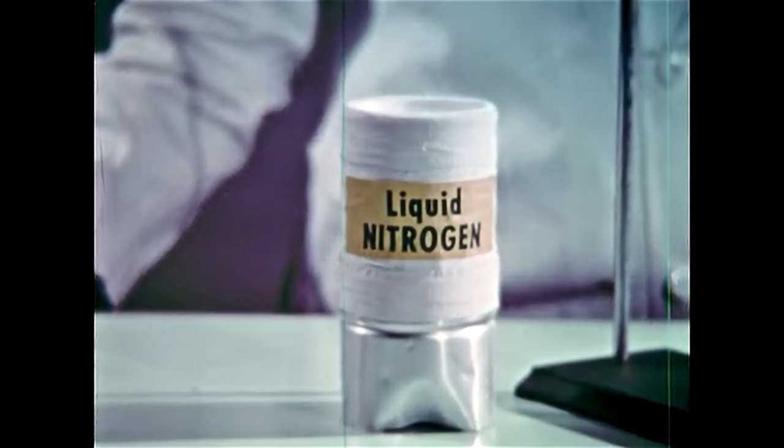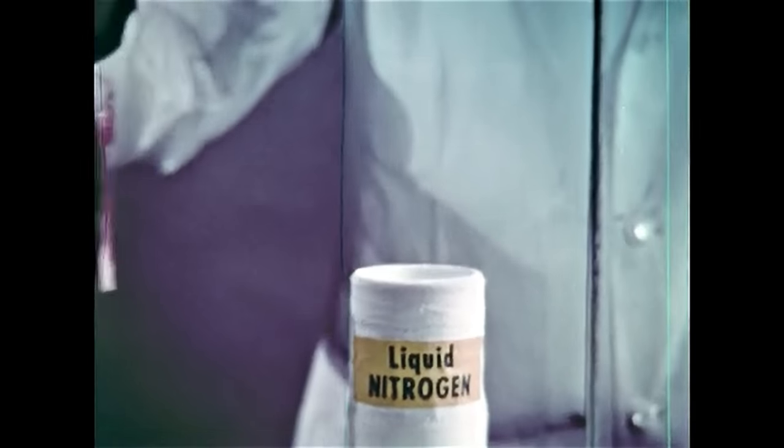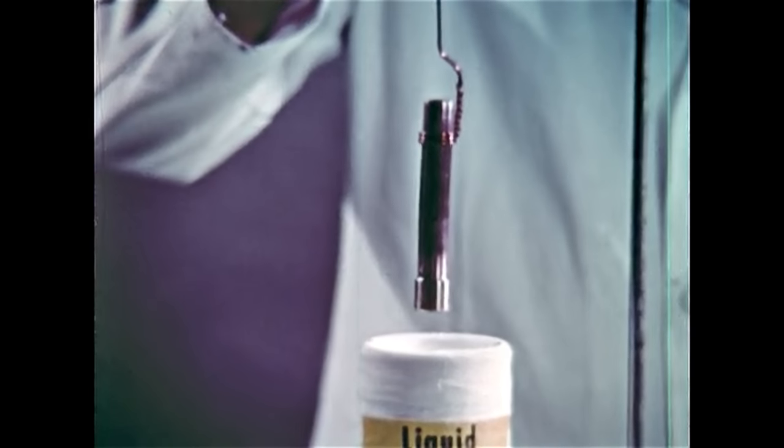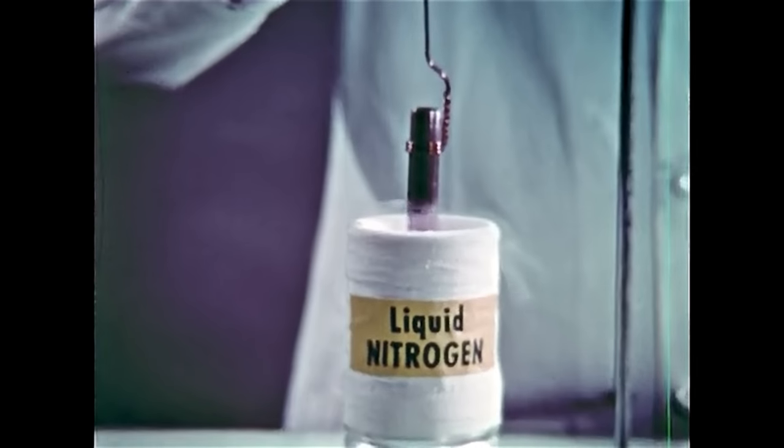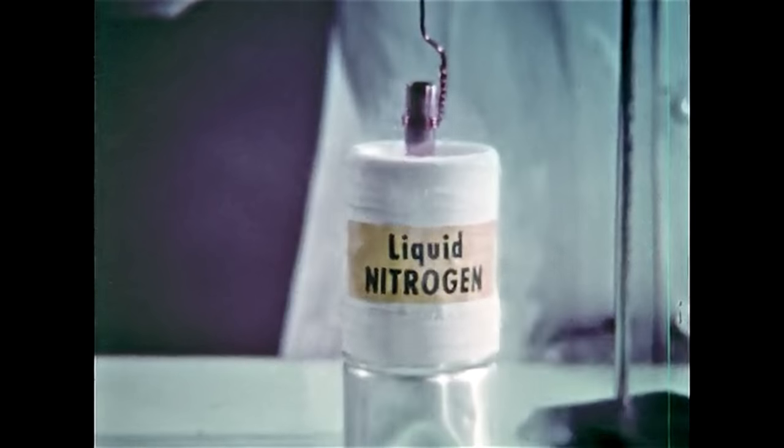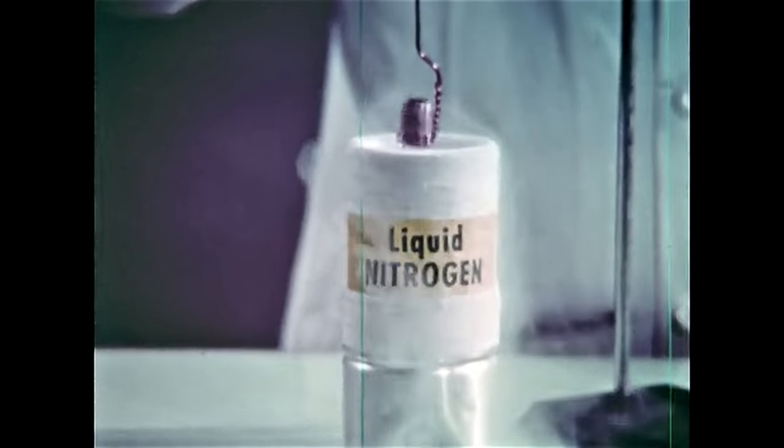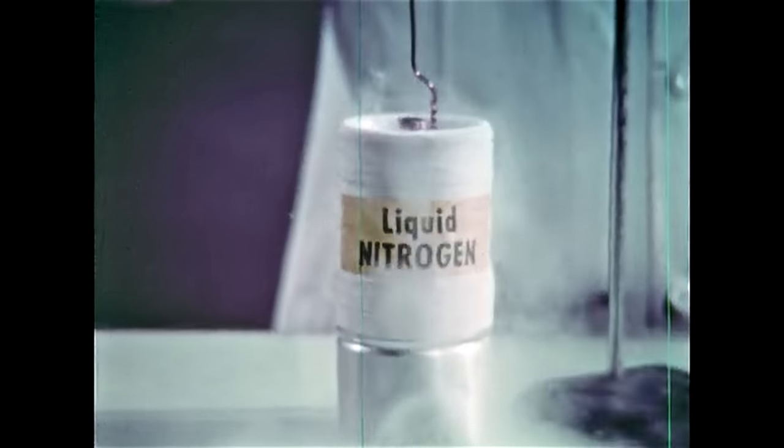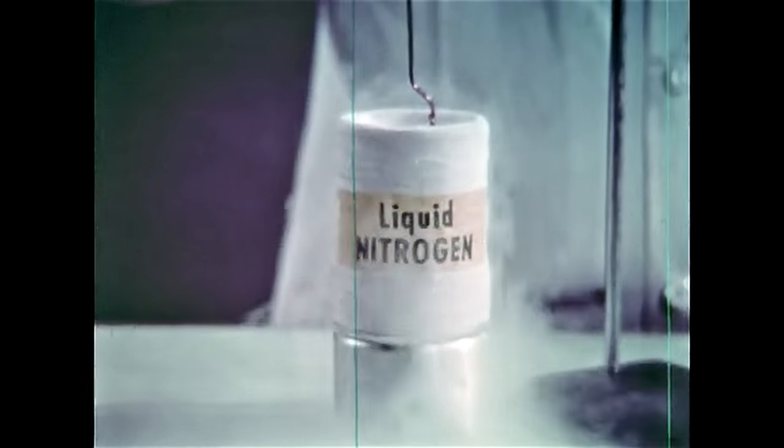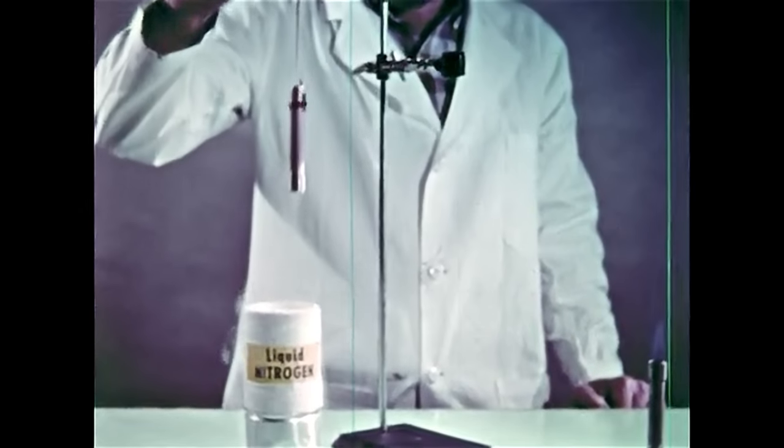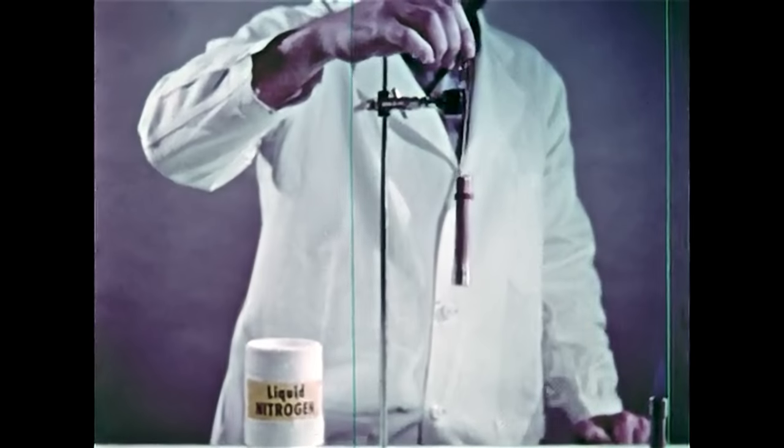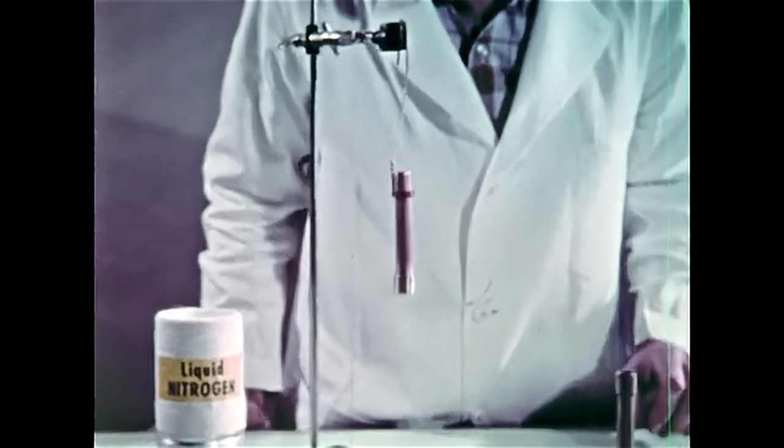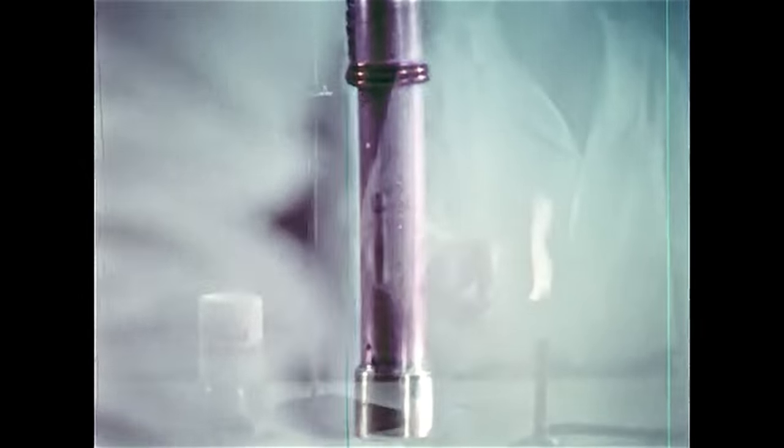This time we're using liquid nitrogen as a refrigerant for this hollow copper tube which we'll fill to bring its temperature below the boiling point of oxygen. The nitrogen is spitting and boiling over as we cool the copper tube down to the temperature of the very cold liquid nitrogen. When the copper tube is hung in the air, its low temperature makes the oxygen condense out of the air on its sides and run down in liquid form.